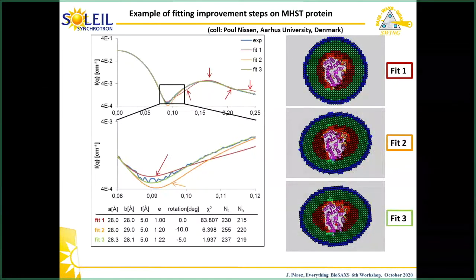And so it's something that is not yet implemented in Memprot, but the approach would be the same. It's just a third density. You will need a third density somewhere, because you have the heads of the lipids, you have the tails of the lipids, and around you have a belt of protein in another disk. So we should add this third layer, but it's not already the case.